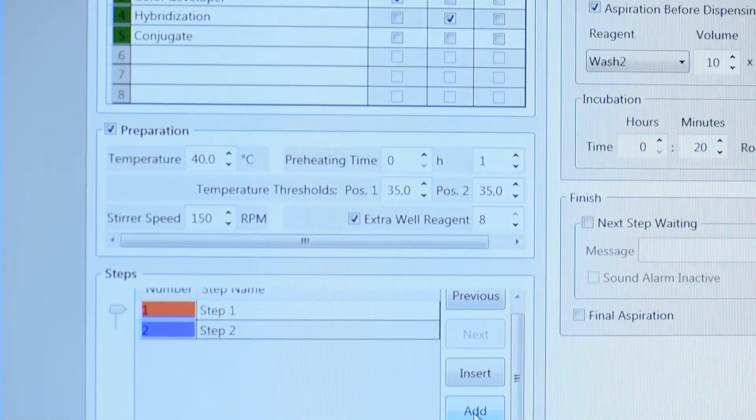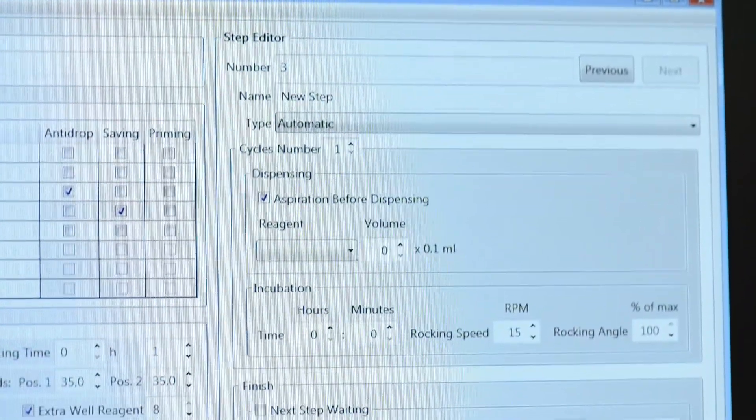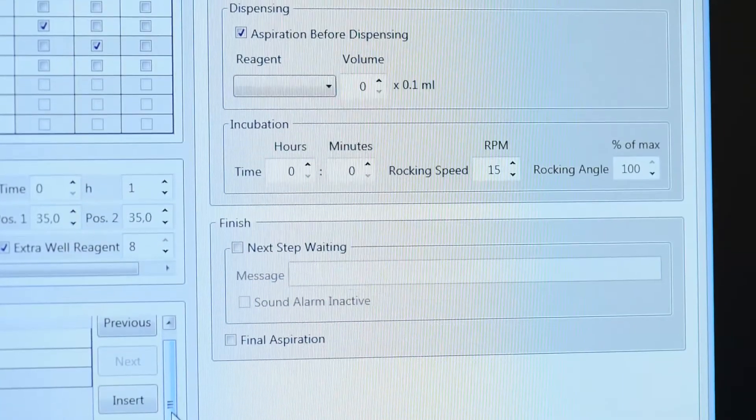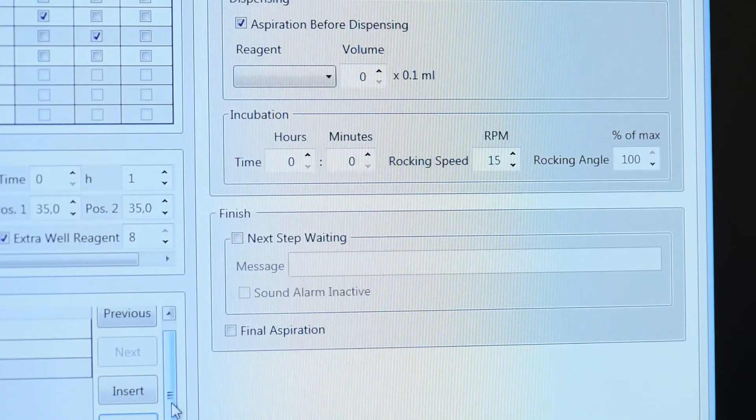For kit suppliers or manufacturers, it is possible to provide a ready-to-use instrument with pre-installed protocols protected from unwanted changes. An OEM version is also available.